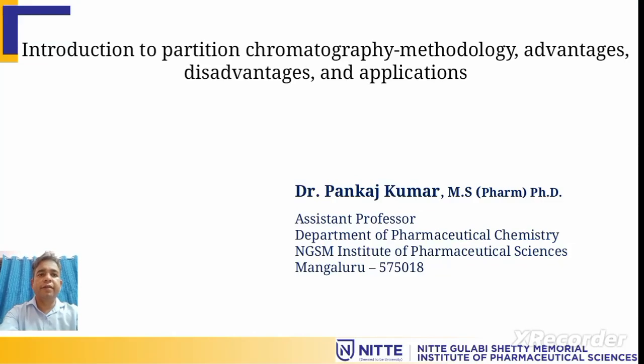Today we are going to learn about partition chromatography. In the previous class we have seen adsorption chromatography. With respect to that, here also we will be seeing the methodology, advantage, disadvantage and application of partition chromatography. What is the basic difference between adsorption and partition chromatography is the content of the stationary phase.